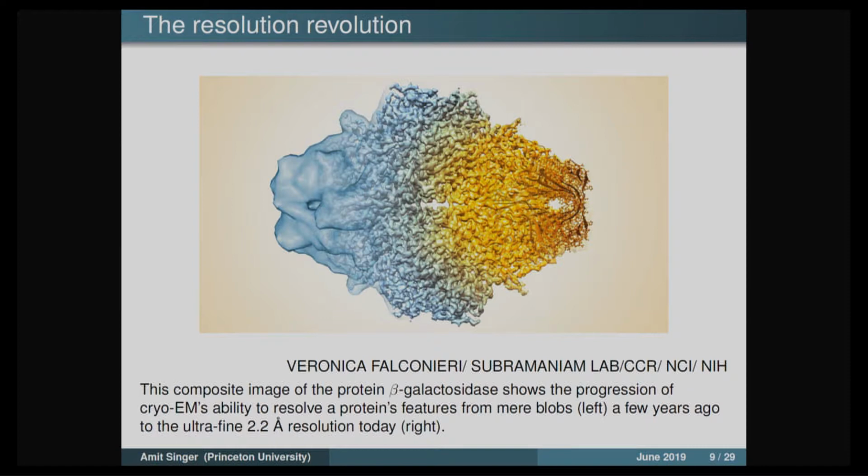Okay, so now CryoEM as a field has really undergone a revolution in recent years. What you see here is a picture that tries to illustrate this transformation, from left to right, a progression over recent years, from let's say 2012 to 2018. On the left is the type of resolution that you could have gotten 6 or 7 years ago, and on the right is the resolution that you get today.